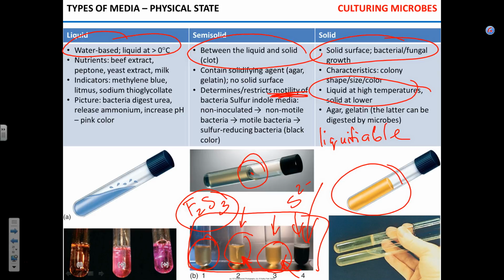We'll get to that. Or you can just take brain, like a cow brain, and treat it with some enzymes like trypsin to break down proteins, and then dry it, the brain. And then when you need the medium, you can dissolve that brain powder in water. You got your nutrients. No, seriously. There's the beef extract, okay?